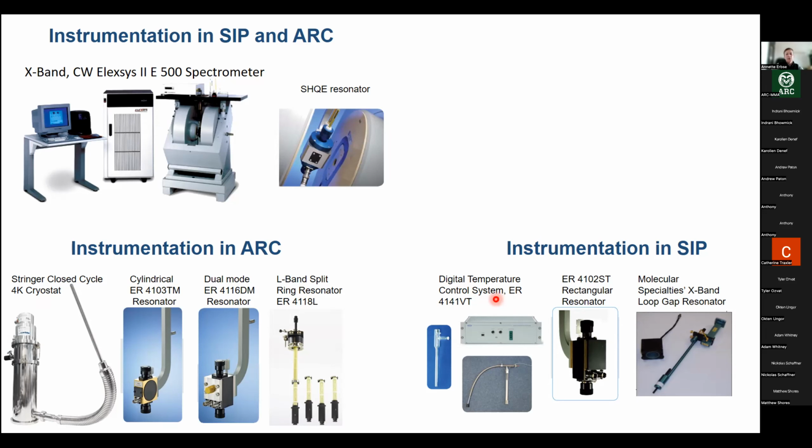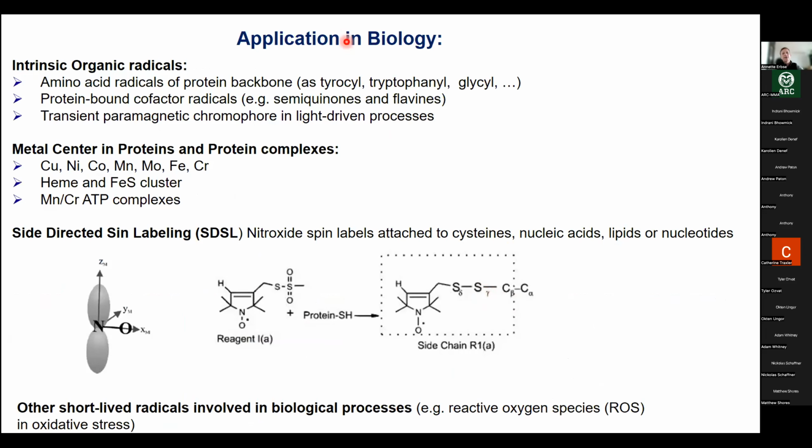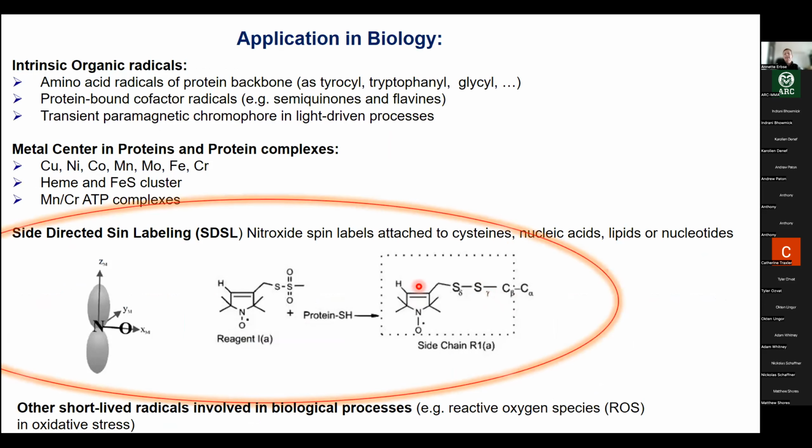Okay, so let's dive in. And I want to start diving in by looking at site-directed spin labeling, because in my, granted, slightly biased opinion, this is one of the strongest methods for investigating biological macromolecules at room temperature using basic X-band CW EPR.